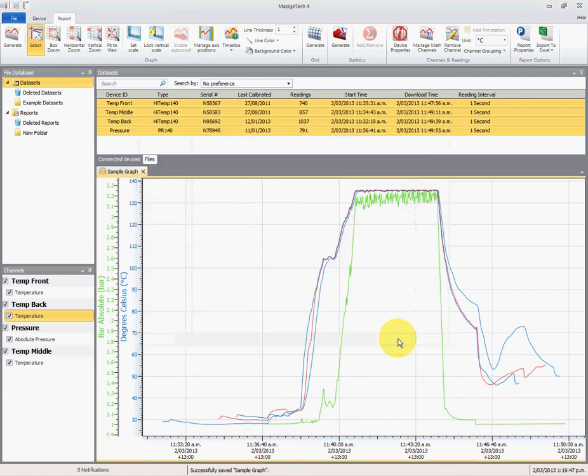Select OK to save that, and that concludes my video on how to prepare a graph. Thank you for listening.